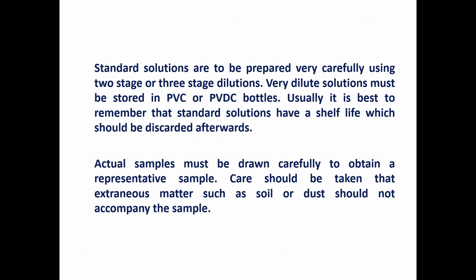Now, standard solutions we have to prepare very carefully using 2-stage or 3-stage dilutions. For example, I want to tell you that most of the spectrophotometric procedures work between 1 to 10 ppm, 1 to 5 ppm, 1 to 100 ppm. Some of them very rarely work at the milligram level.